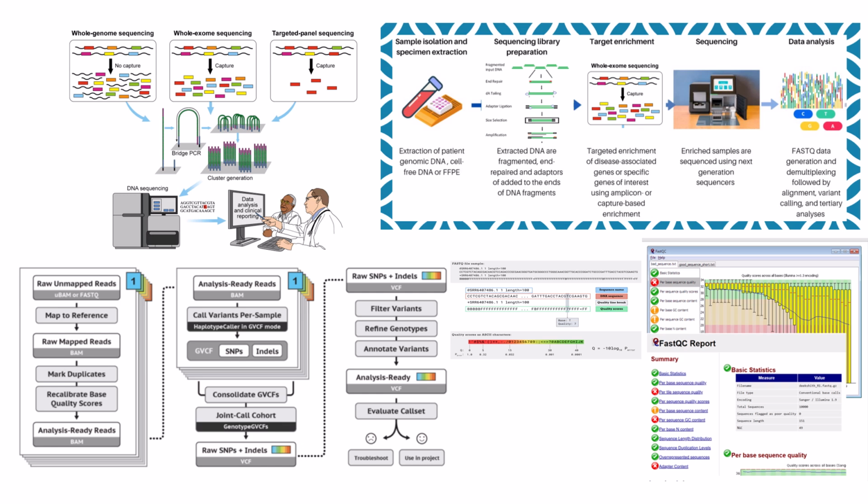Wow, okay. So it's like a really strict checklist for each potential variant. Does it have enough reads supporting it? Is the quality score high enough? Is there weird bias in which DNA strand shows the variant? That kind of thing. Exactly that. Think of them as quality control gates. Each potential variant has to pass these tests. If a variant fails one or more of these filters, maybe its quality score is too low, or it shows significant strand bias, suggesting it might be an artifact, it gets flagged as low quality or filtered out. So this step dramatically cuts down the number of variants you have to consider. Hugely. It aims to remove the vast majority of false positives.